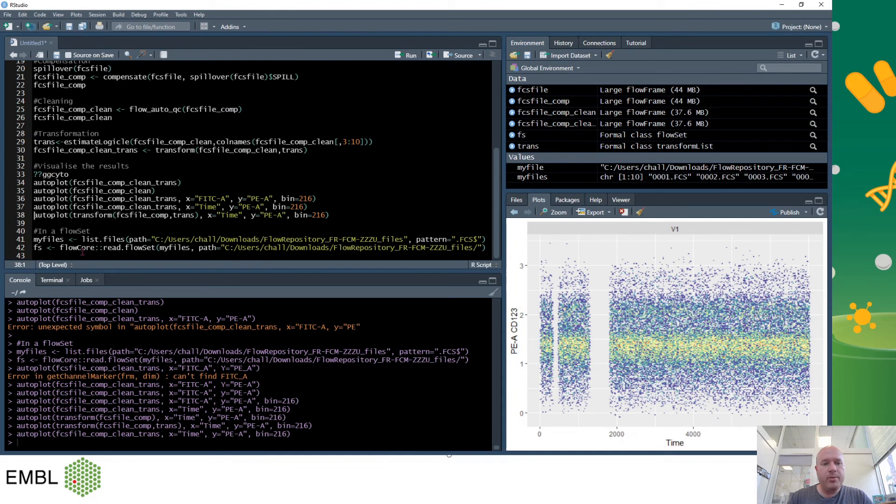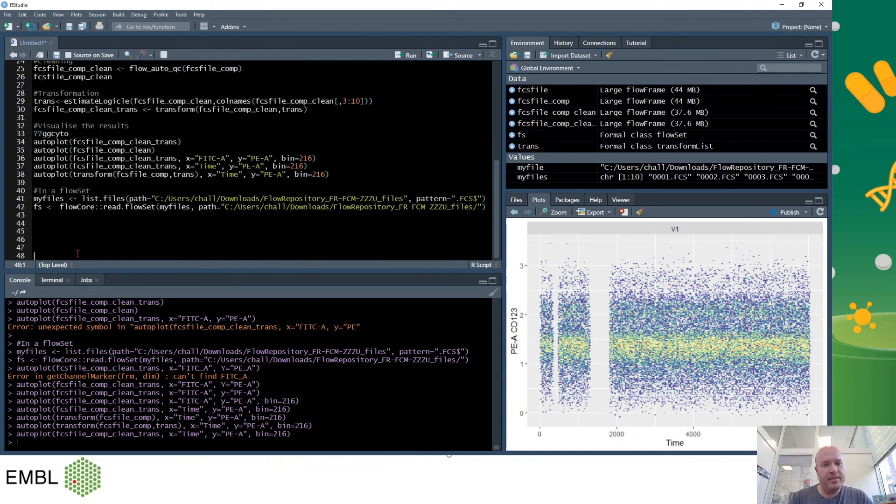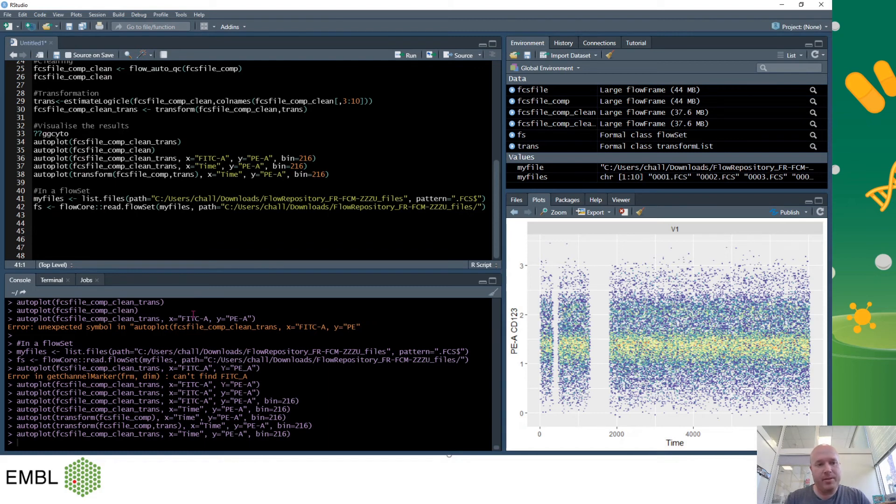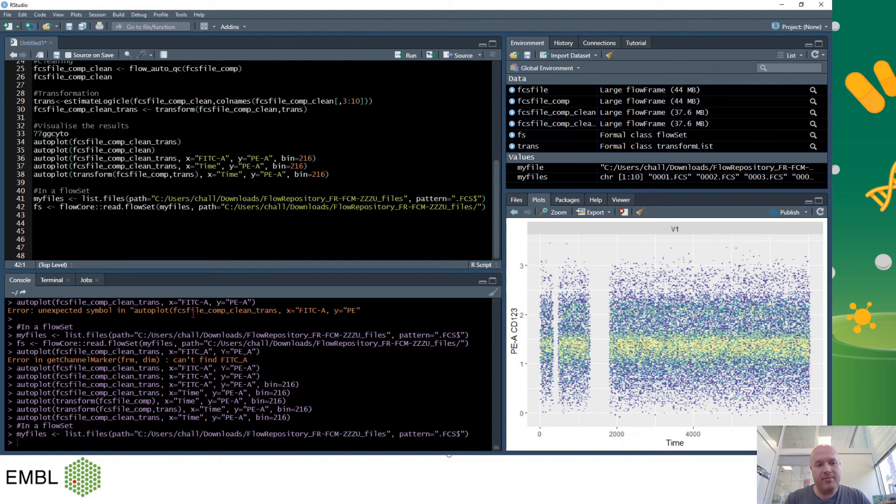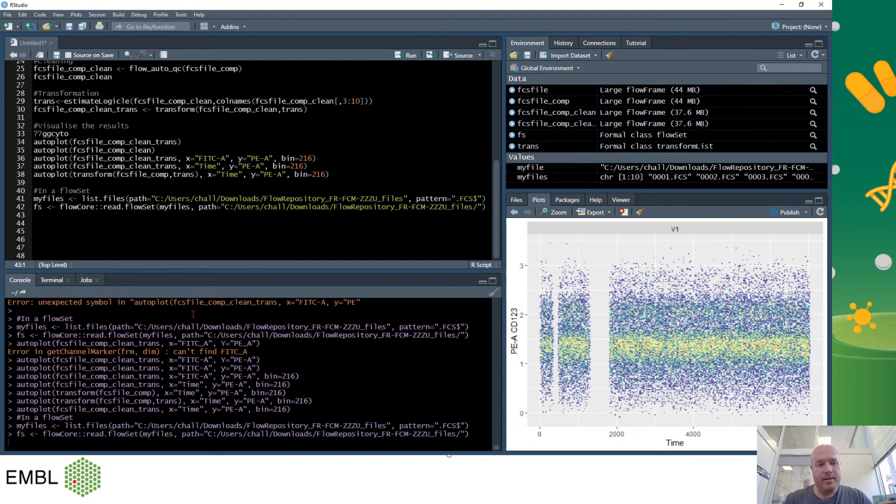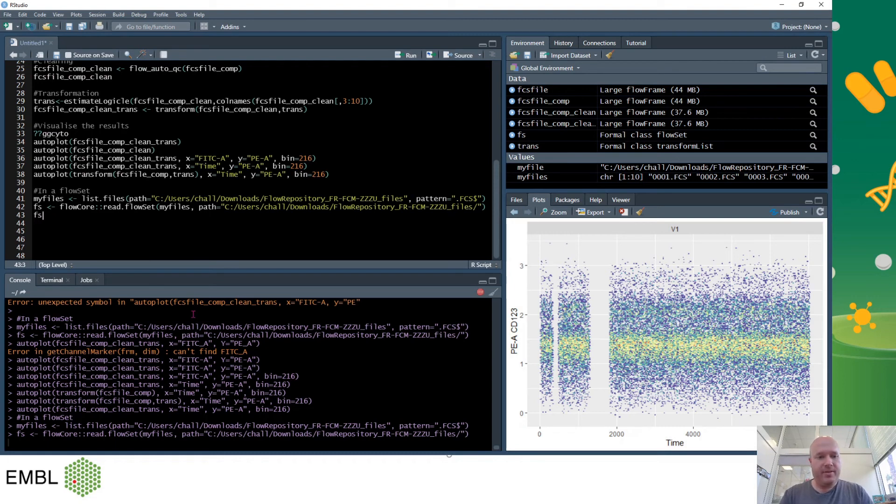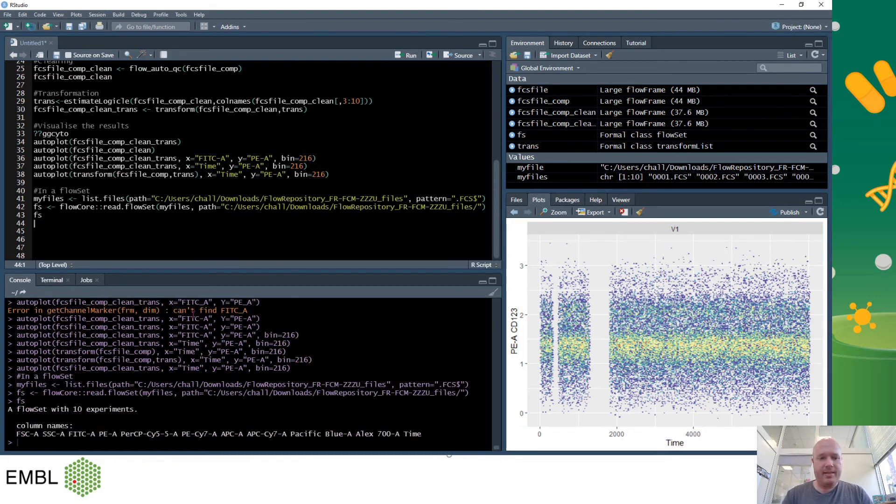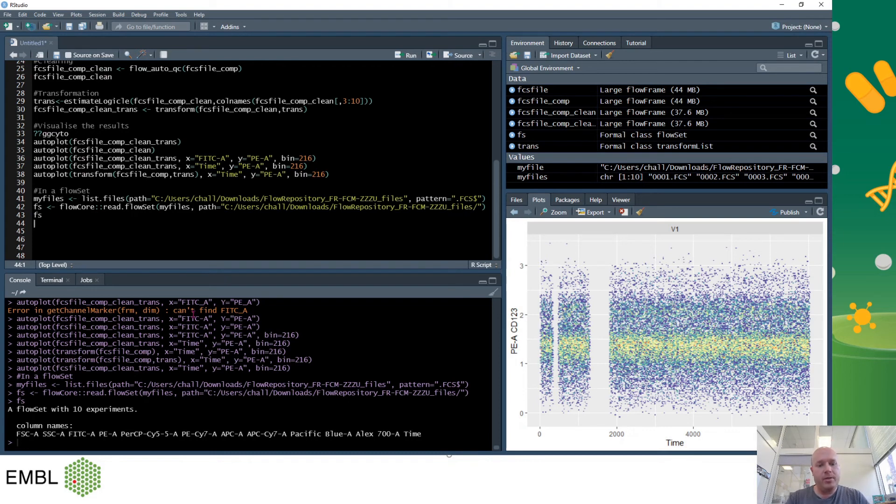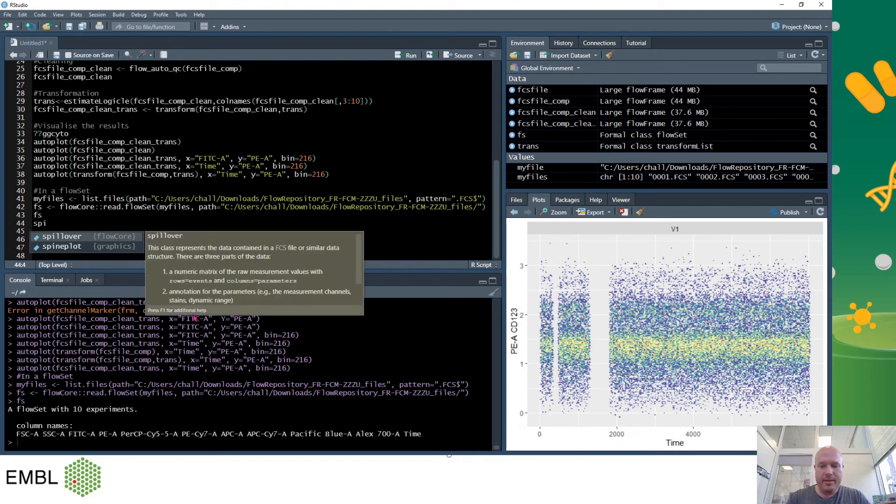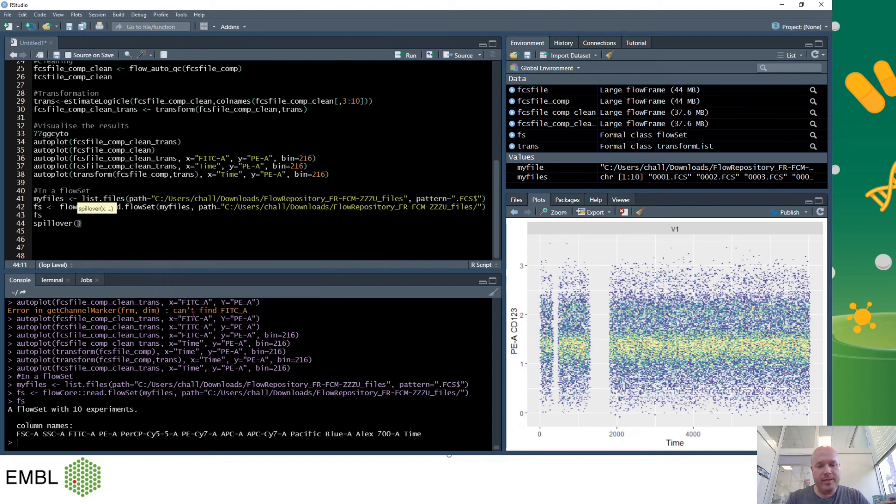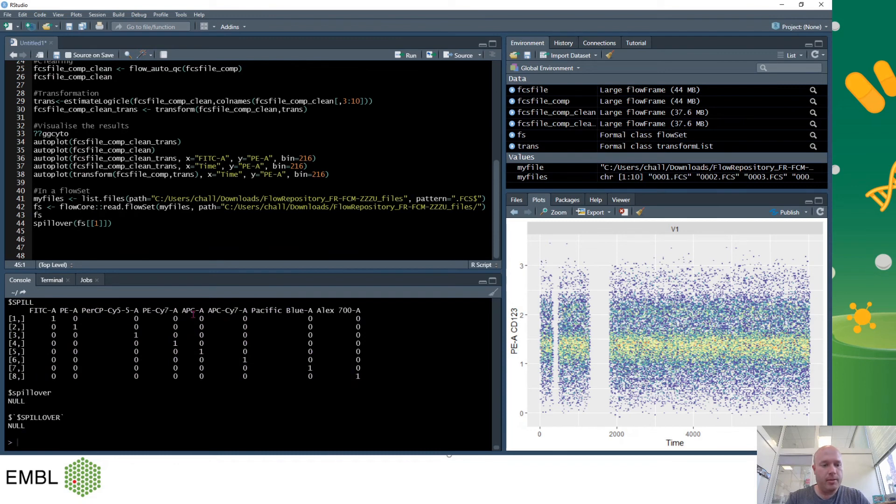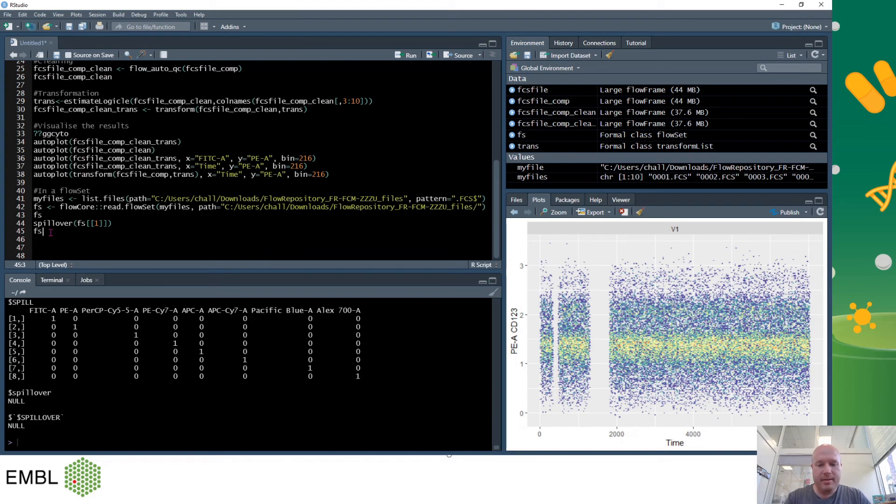So if you wanted to do this in a flow set over multiple files it's exactly the same effectively. So in a flow set I've now got my files and I put these all into a flow set. And if I type in fs I can see that my flow set contains 10 experiments. And if I wanted to look at the spillover I can do this. So if I wanted to compensate, I'm going to do spillover again fs but then I need to choose one, so this is the first file, this is the spillover for the first file. If I want to compensate I just do the same as I was doing before.